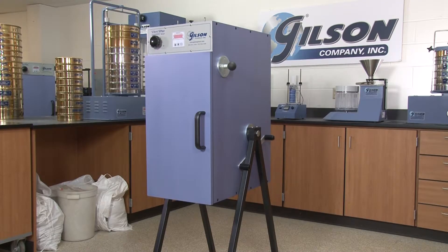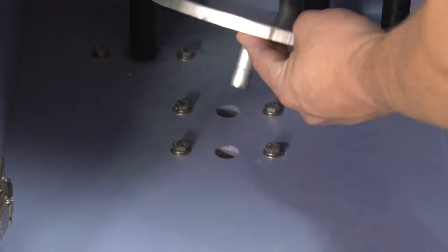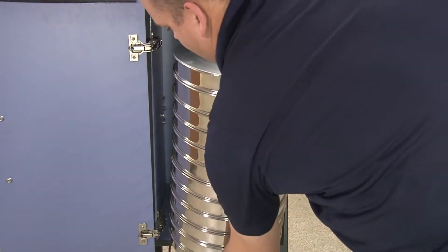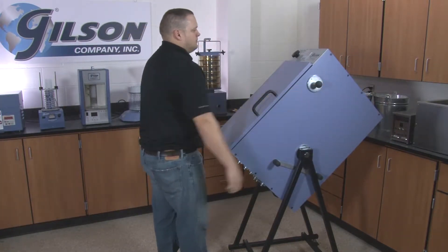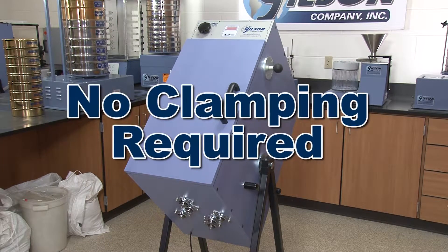The Gilson rotary sifters are designed for safe, easy, and dust-free operation. Simply select the sieve diameter, insert the sieve turntable, place your sieve stack inside the cabinet, close the cabinet door, and using the ergonomically designed handle, rotate the unit to its 45-degree test position with no clamping required.